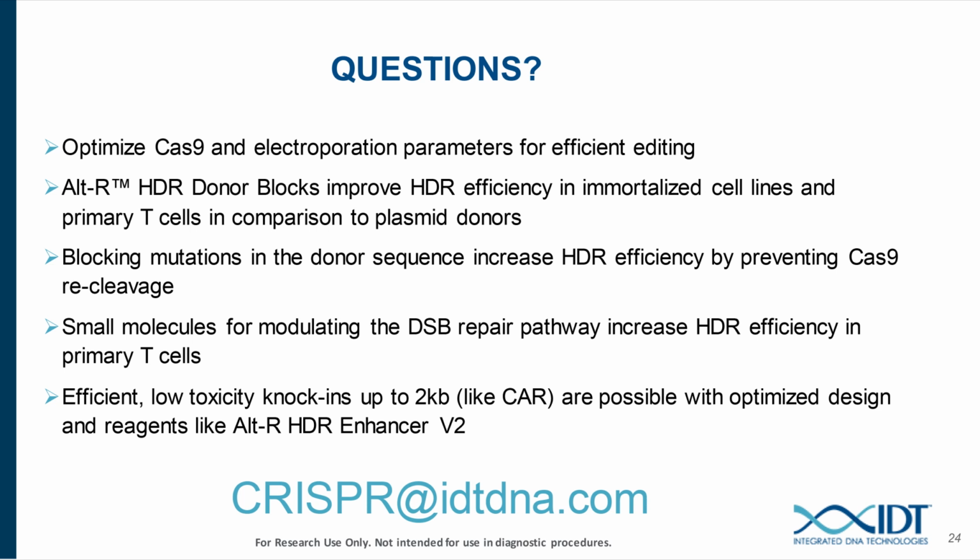Yes, this is something that we're trying to figure out ourselves. It's likely to be something about DNA accessibility or chromatin structure that varies human to human. And all the data I showed in this webinar was analyzed by NGS and was background corrected for SNPs. So it's likely to be something sequence independent and more physically variable from donor to donor, but we're still investigating.